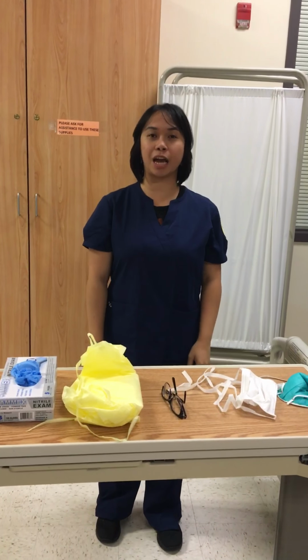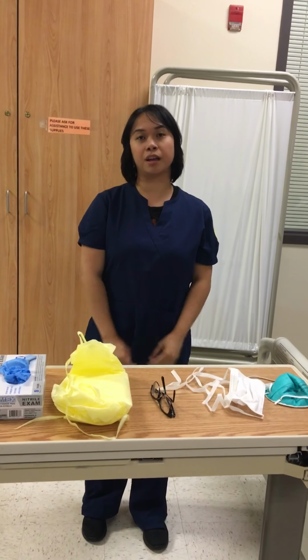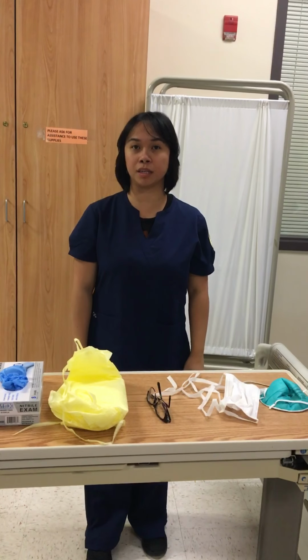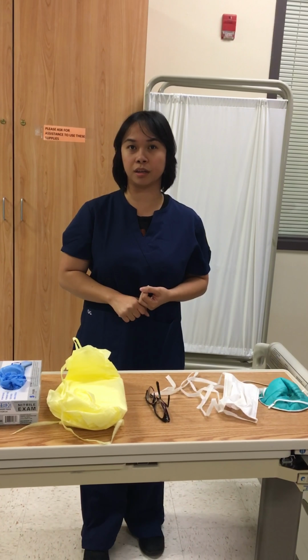Hi, I'm Zita, and today I will be going over personal protective equipment, or PPE. There are two kinds of precautions where you need to use PPEs. There's standard precaution, and then there's transmission-based precaution.